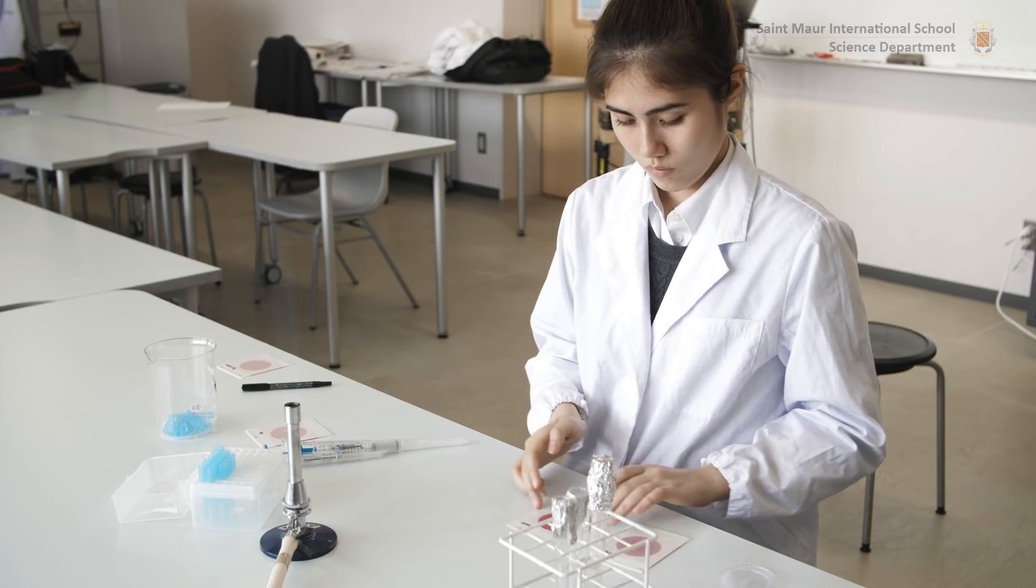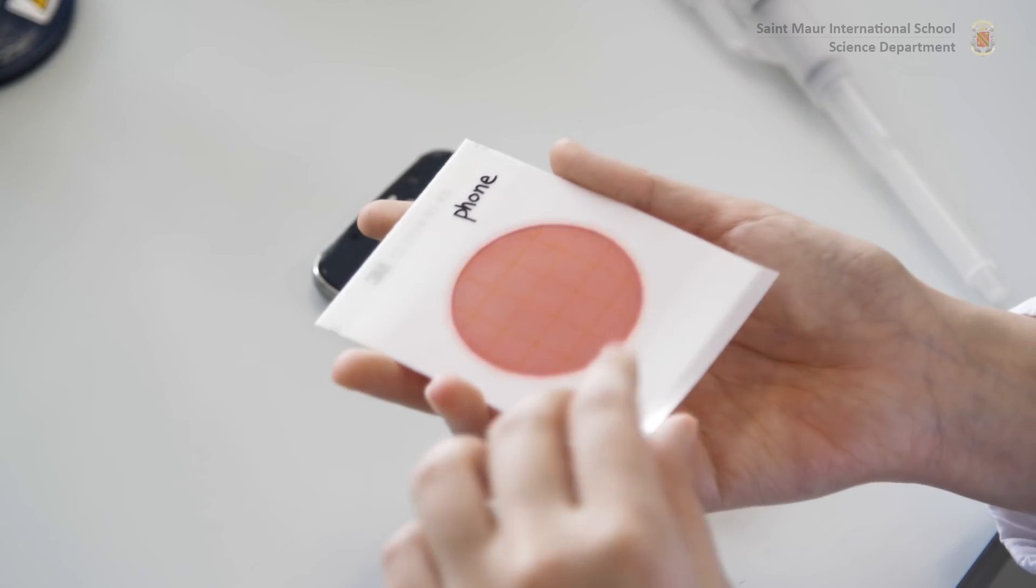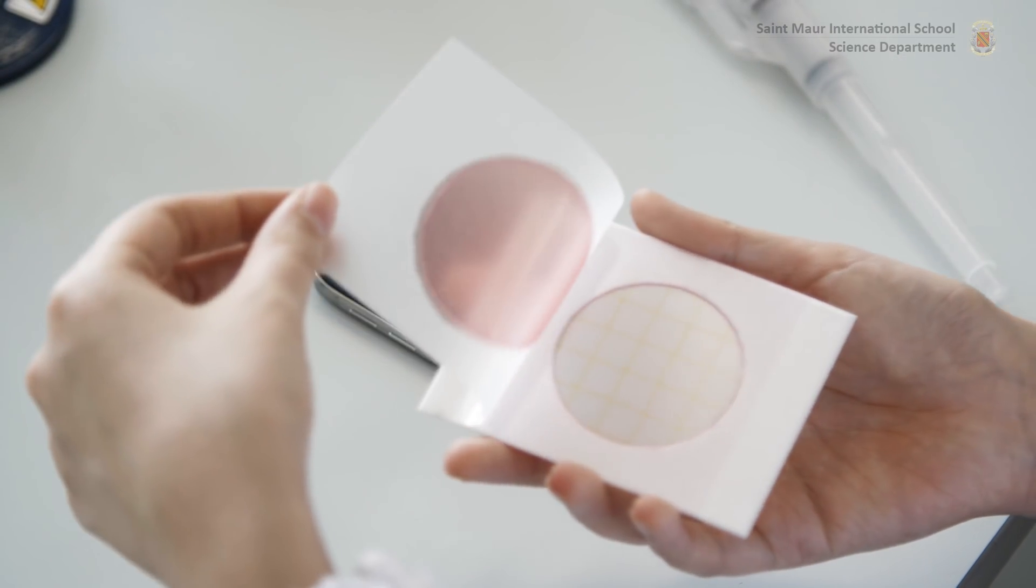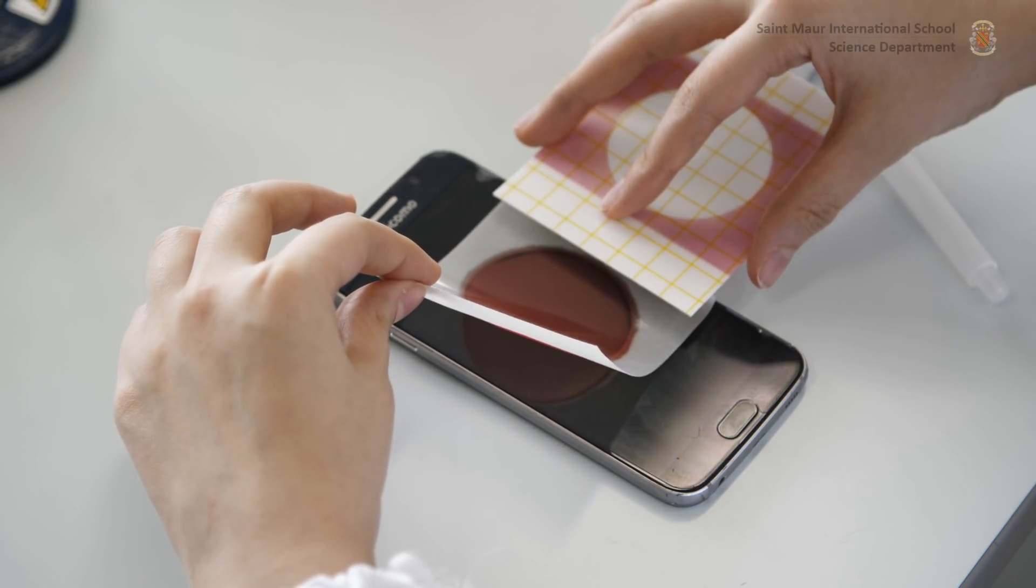The Petrifilm is left to jellify for one hour at room temperature. Sampling is done by peeling and stamping gently the cover sheet of the Petrifilm on the surface to be tested for a specific duration.